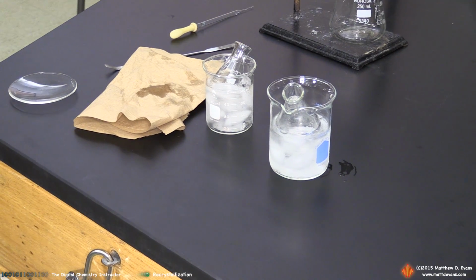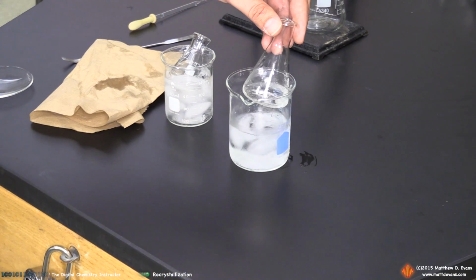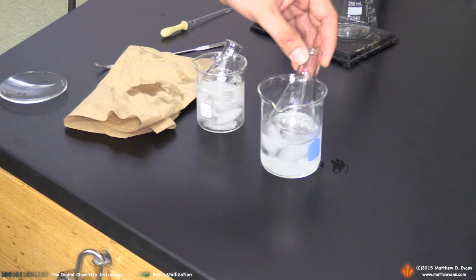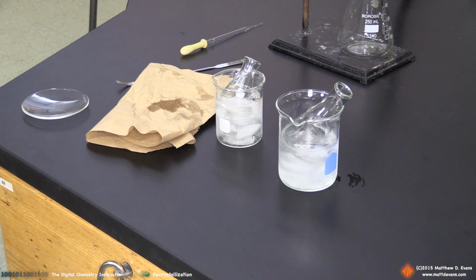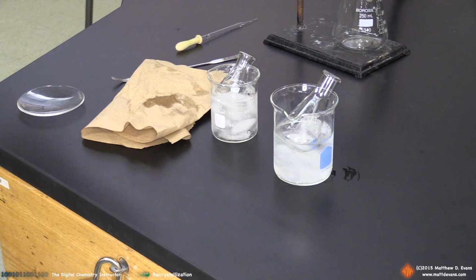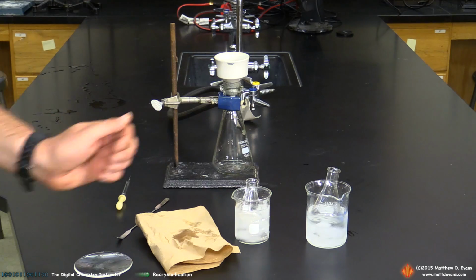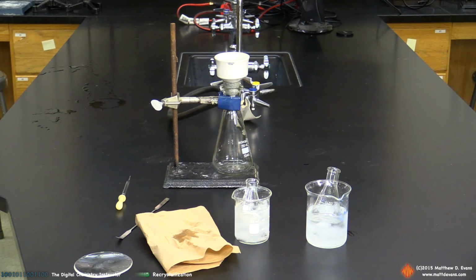And just make sure it doesn't tip over in your beaker. That's a bad thing, of course. Meanwhile, I've got the solvent that I didn't use in the recrystallization in an ice water bath as well, because I'm going to eventually use this to rinse the crystals and also pre-wet the filter paper. But otherwise, let this sit in an ice bath for about 5 minutes before you carry on, and I'm going to show you that in just a second.